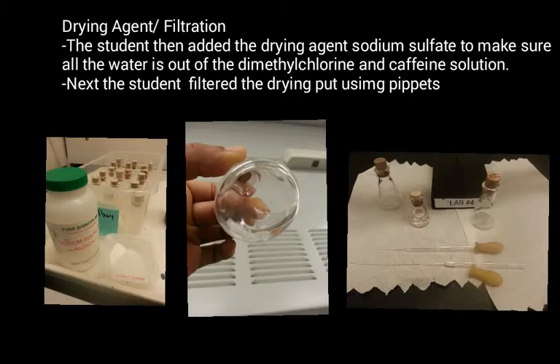dichloromethane and caffeine solution. After, the student has to filter out the sodium sulfate from the caffeine and dichloromethane solution. The student used pipettes with cotton and separated the sodium sulfate.